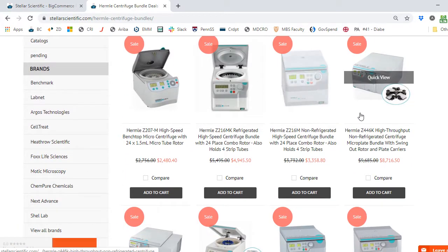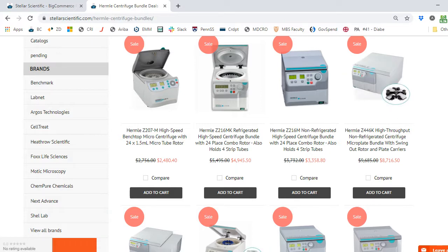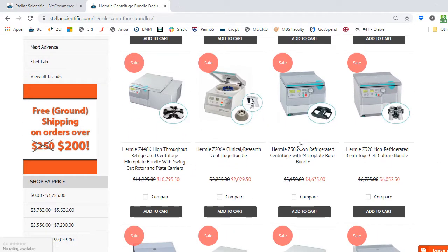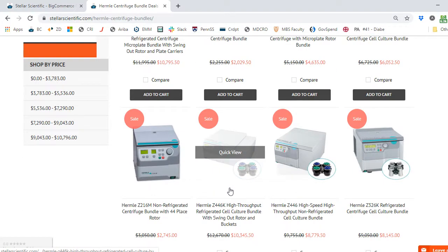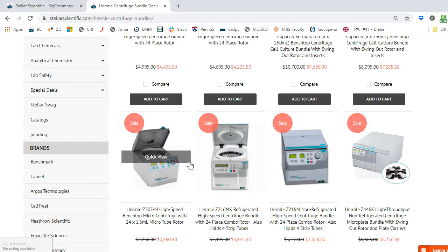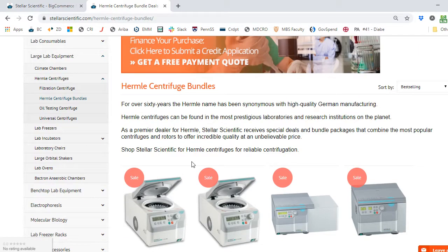Scrolling down a bit further, we've got the Z446K — a centrifuge package with a microplate bundle and swing-out rotor package. Further down, we have non-refrigerated microplate rotor options, refrigerated plate options, swing-out bucket options, and more. So if you know what you're looking for, the bundle is going to be the best way to go — you'll want to start your shopping here.